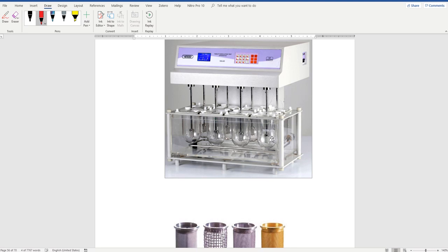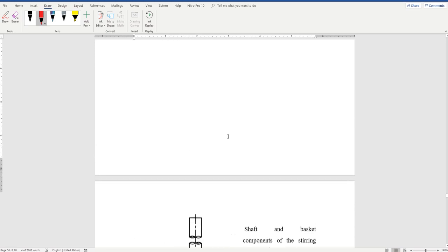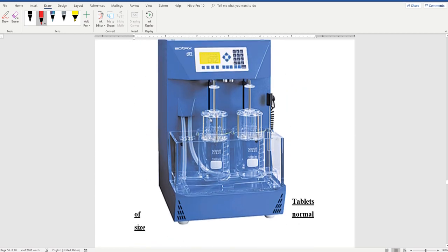But see the difference here, because this difference is very important. With disintegration it's allowed plus minus 2 degrees. Here it's only allowed 0.5 degrees. يعني it can be 36.5 to 37.5. It cannot be more, it cannot be less than 36.5. It's difficult to control the temperature of the disintegration apparatus. If we go back, it's difficult to control the temperature here.